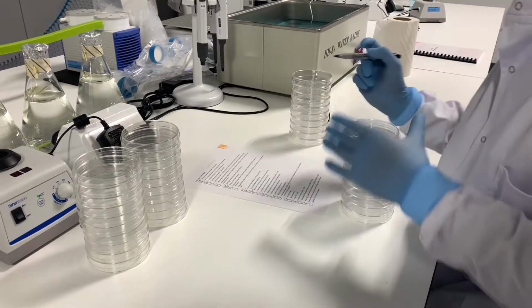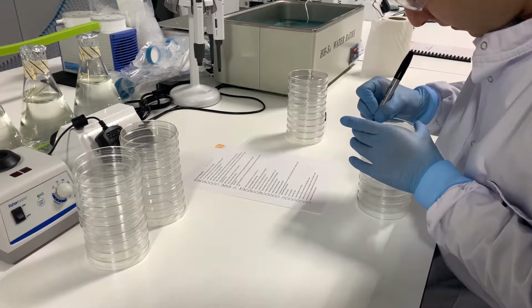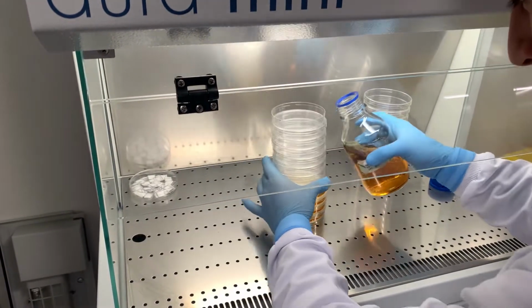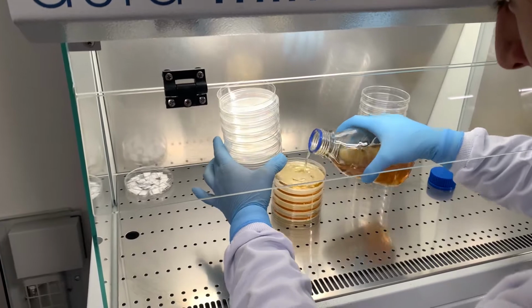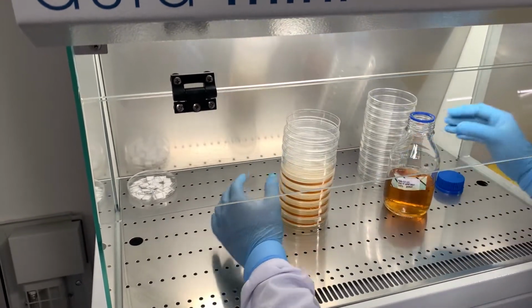Test tubes and agar plates are labeled and poured, and diluent dispensed into containers. Interfering substance, i.e. to mimic clean or dirty condition in real life, are also prepared and diluted to the correct concentration prior to being mixed with the test organism culture.